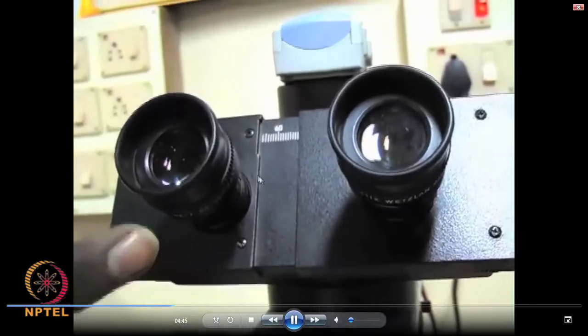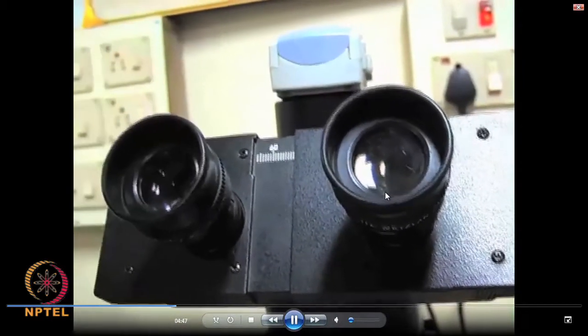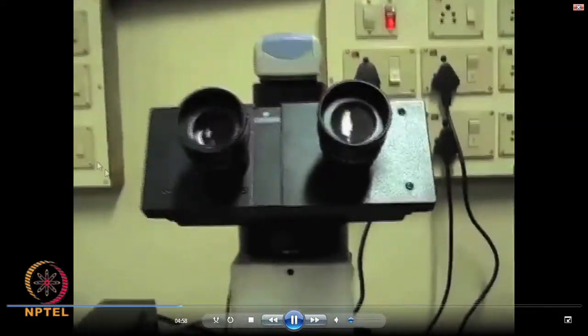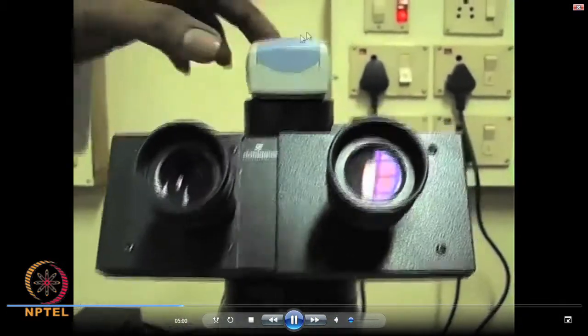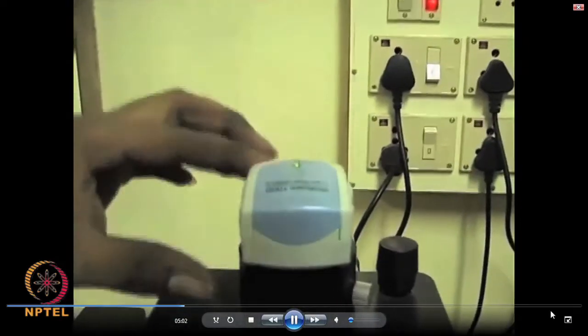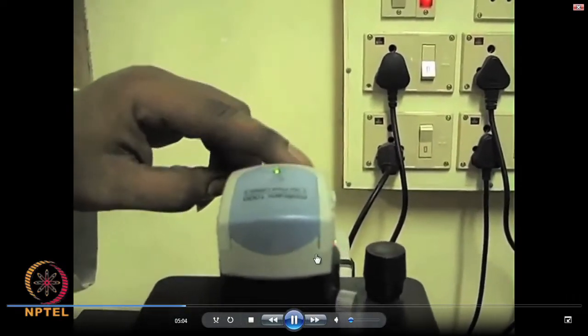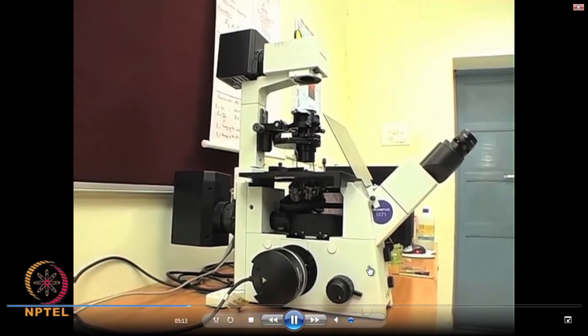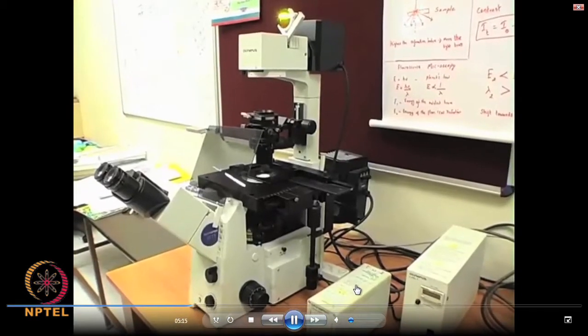You can directly view through the eyepiece, as well as look at the computer monitor, because it is interfaced with the CCD camera. So either you can look through the ocular directly, or you can look at the computer monitor because it is attached with the CCD camera. Now this microscope is where I just left off in the last class.